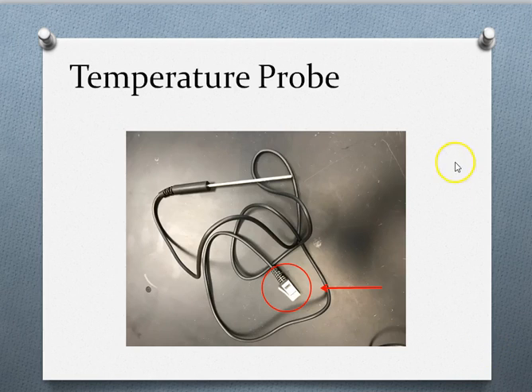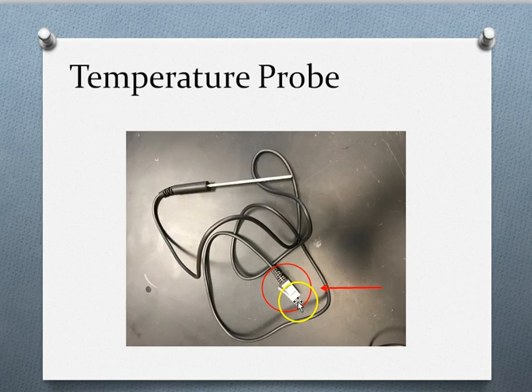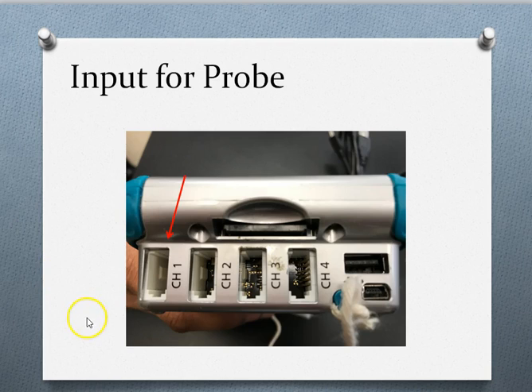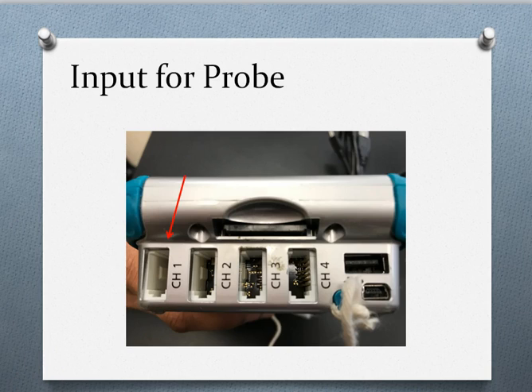The second thing we're going to plug in is the temperature probe. The temperature probe has the sensor tip at one end, and the other end has a white jack that reminds me of a landline phone jack. That phone jack plugs into the top of the LabQuest — you plug that white plug right in there. One end of the probe will be in your beaker or test tube of Lauric acid, and the other end goes into the so-called channel one.